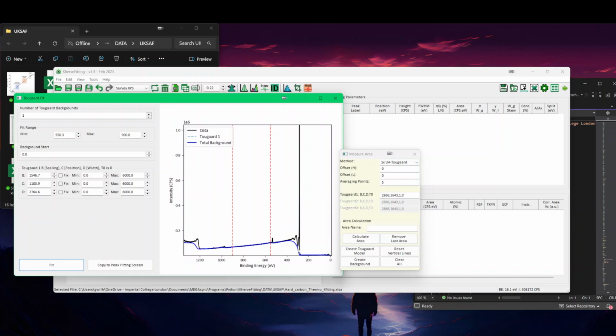And now we get a Tougaard which has a correct value. Some people may want to have the C slightly lower. The default value by Tougaard is to have it at 1643. And in here we have 1100. Okay, so that will give something like this.